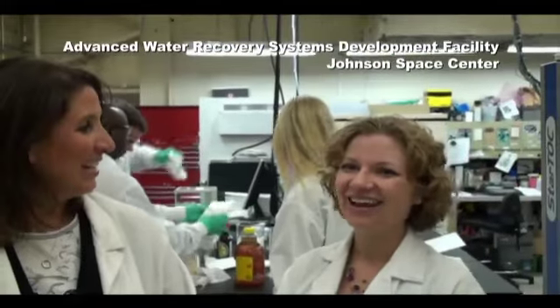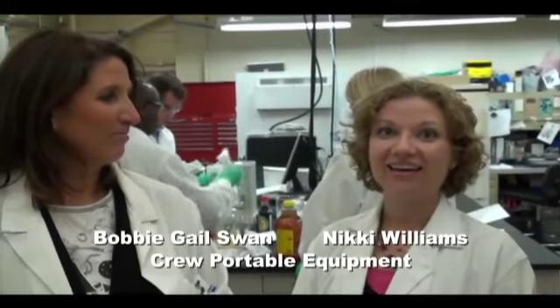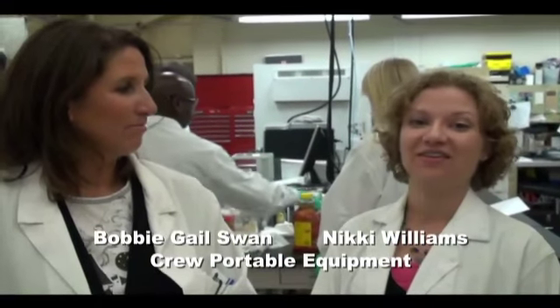So what we're doing next month is a test on a trash bag, and we need to put all the trash that you might have on a space mission in that trash bag. That includes potentially vomit, as well as diapers filled with urine and fecal matter, as well as food trash. So what we're doing today is coming up with the recipe for vomit, so when we do the test on the trash bag, we know how to mix it up to simulate what we're trying to do.